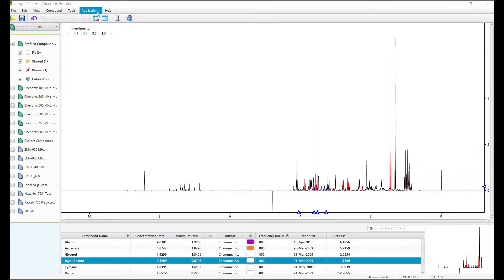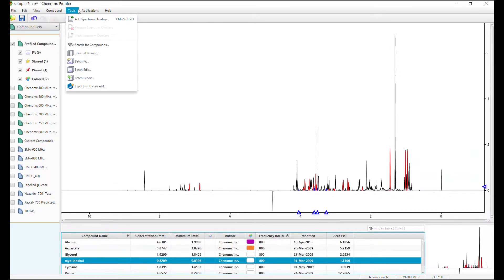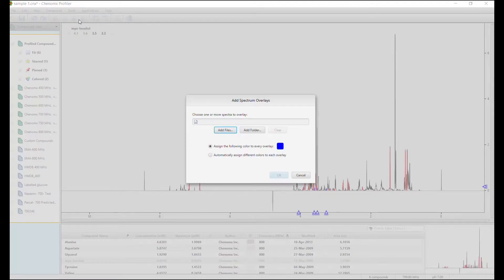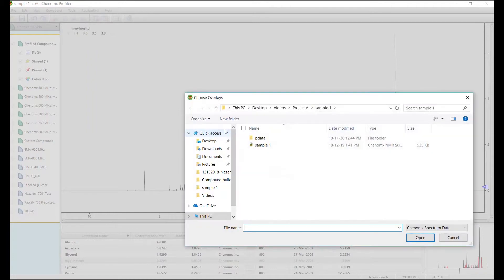Let's try it. Choose a CNX file you would like to overlay on your sample spectrum. In this example I'm only selecting one spectrum to overlay, but you can overlay more if needed.